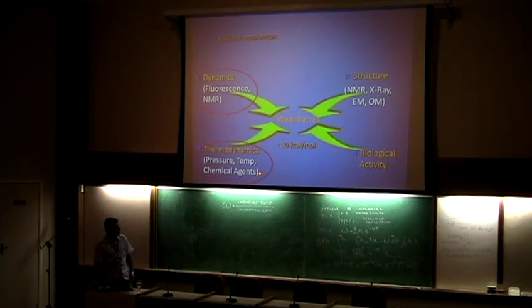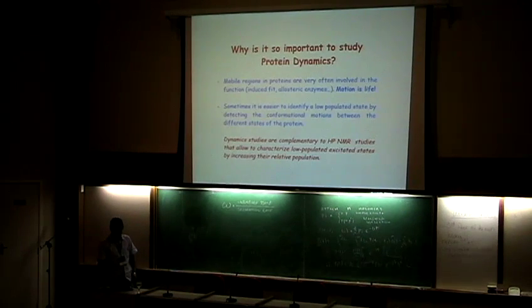I'll try to sell for people why it's important to use the pressure dimension in addition to other ways of perturbing proteins. As I mentioned, before I had prepared a lot of slides on NMR, but I won't go too much into them. So I'll just come back to this question that Ana Paula addressed quite well, that NMR can be a very good tool to explore the dynamics of proteins.